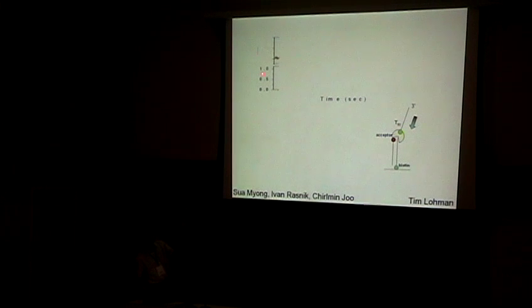So this is the data from a single molecule as a function of time, showing basically zero intensities for the green and red before protein binding. Then as time goes on, you see a sudden increase in the intensities due to a single protein binding. We can show that this is a single protein by measuring the intensities. This is followed by a gradual decrease in green and gradual increase in red. The bottom shows the FRET as a function of time, which also shows a gradual increase, consistent with the idea that this is moving in this direction. Okay?